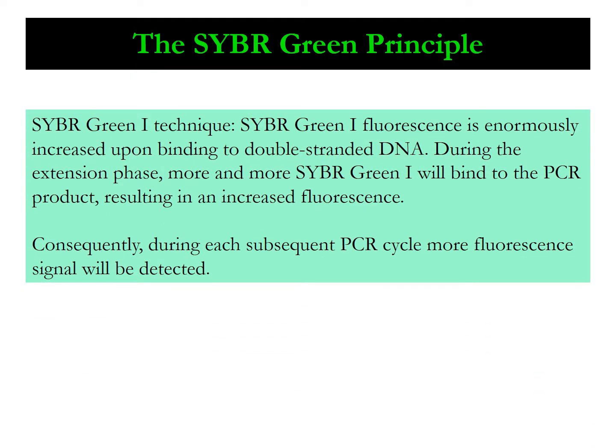The SYBR green binds specifically to double-stranded DNA. It does not bind to single-stranded DNA. This renders it visible during the process of extension and annealing.